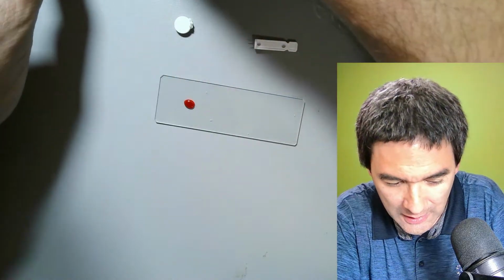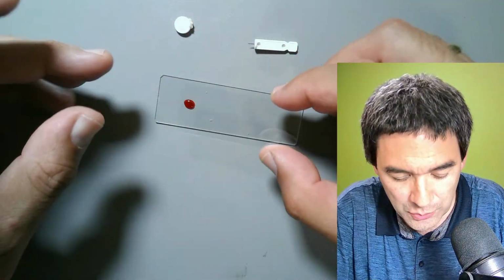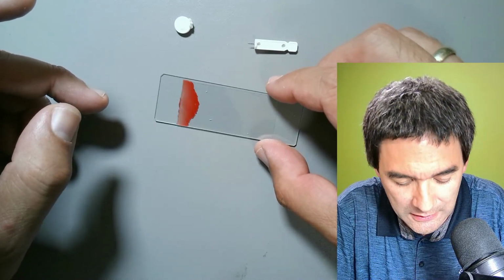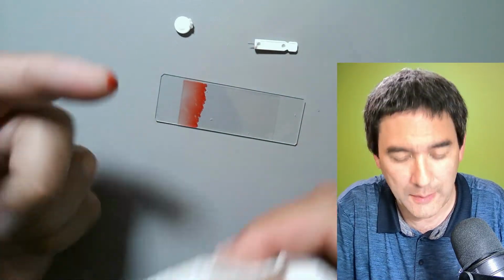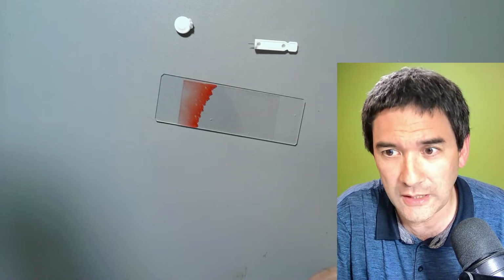Rather, I'm going to add a fairly large cover glass, because I want to have a very thin film of blood directly beneath the cover glass. Let me wipe this again here. Because there is a cover glass on top, it's not going to dry out as quickly, and that's actually what I would like.